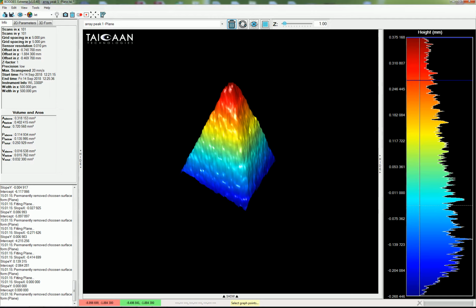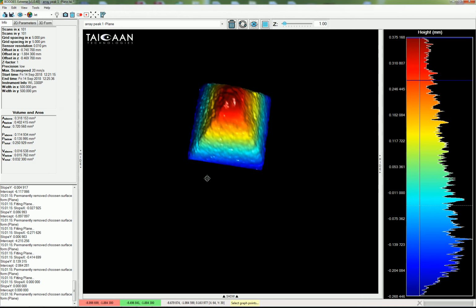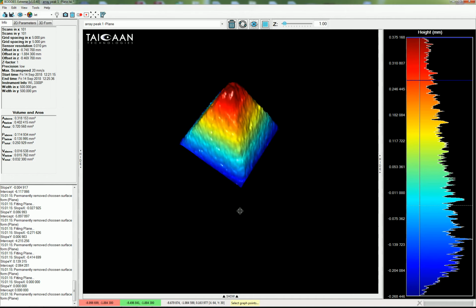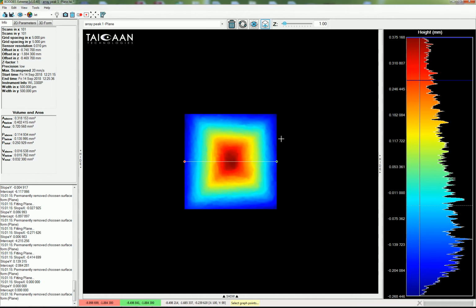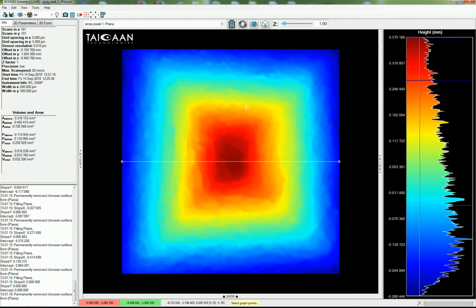Very quickly you can see the window in the bottom left is fitted. Because they're quite small data sets, it's fitted all of the planes, and now all of the planes have been centered around 0. All of the pyramids have been centered around 0. And let's take a look at these. So here's the first one. We'll do them in the top-down view, and these are very nice, quite artistic images. So here's the first one.